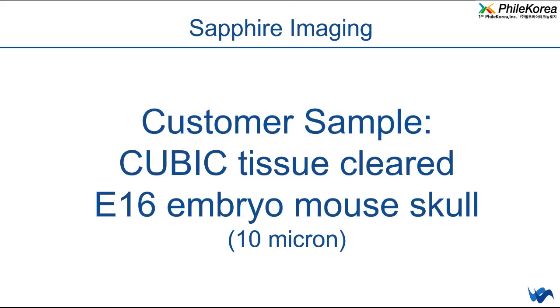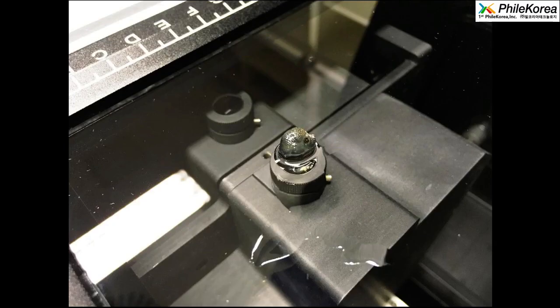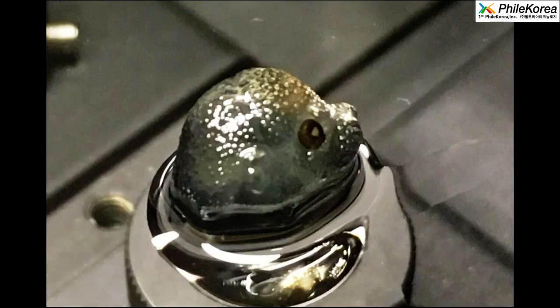This is an additional example. We used here CUBIC. CUBIC is a protocol also to clear the tissue. And we cleared here an E16 embryo mouse skull and scanned it with 10 micron. You see here the embryo mouse skull lying on the glass surface. And when I zoom in, you can see it here. By the way, when I put tissue on the glass surface, I use water and put the tissue on this water drop. It's a nice lens effect, right? You get the images sharper because the laser is going better through water than through air, of course.